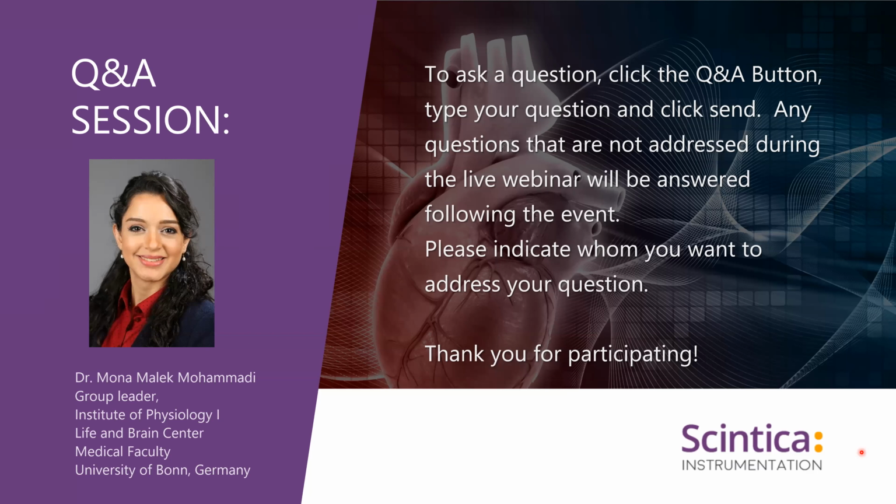Another question that was asked is what are the differences between the nTAC surgery and adult TAC surgery? Actually, the general principles are the same. So you are constricting the aorta, but you need to pay attention that for neonatal mice, you need microsurgery skills and you need to operate under the microscope. And most importantly, you have to be very fast.